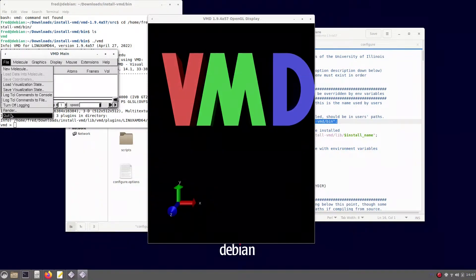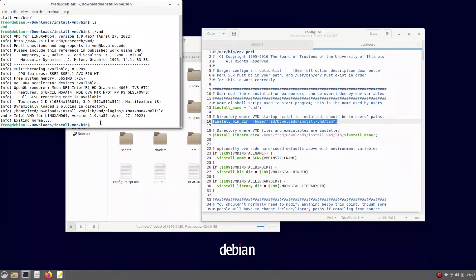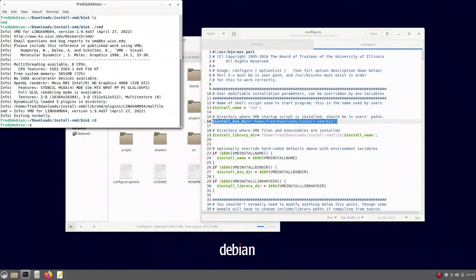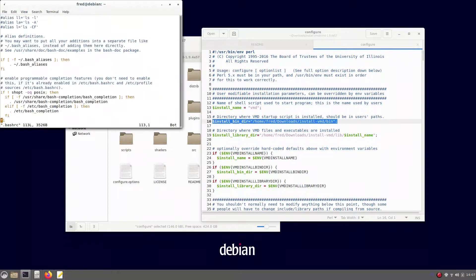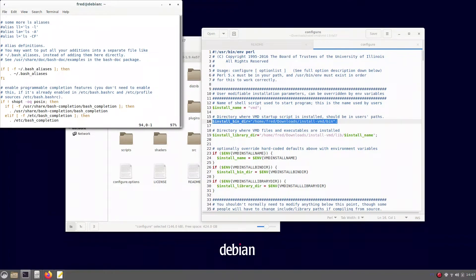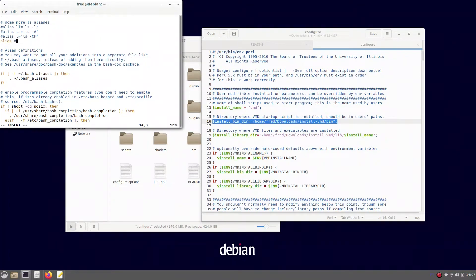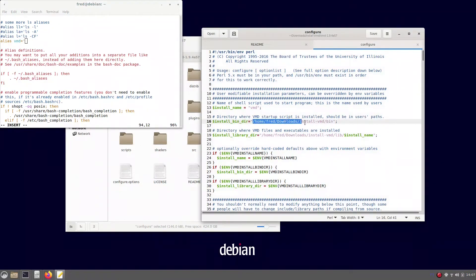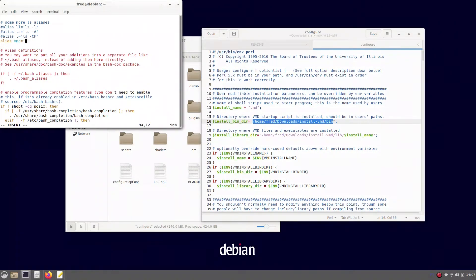And if you're planning to launch VMD from any place, you can just go to your root directory by typing cd and enter, and open your dot bashrc file with any text editor. In this case, we are going to use vi, just because I'm used to that. In this file, you are going to add an alias for VMD. With this alias, you have to specify which word you are going to use to call VMD, and then the entire VMD launcher script path, with no shortcuts. Please don't mess up with the single quotes here.